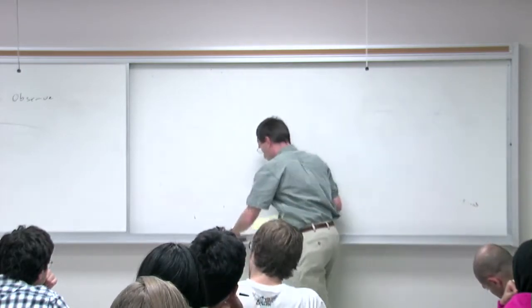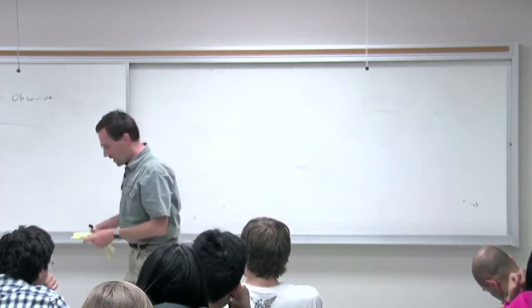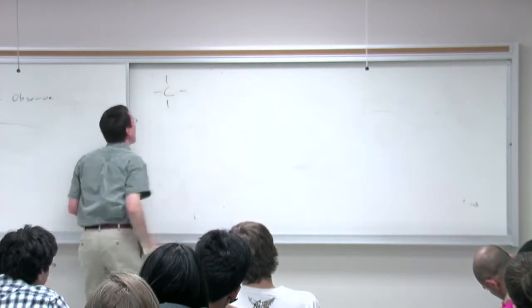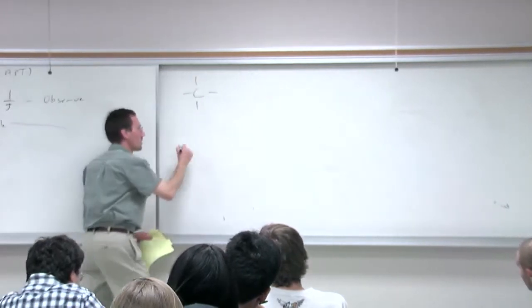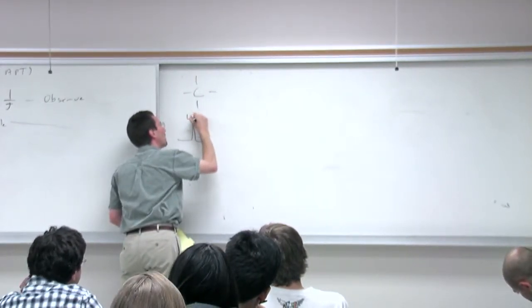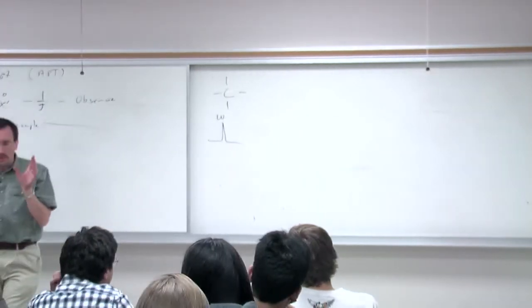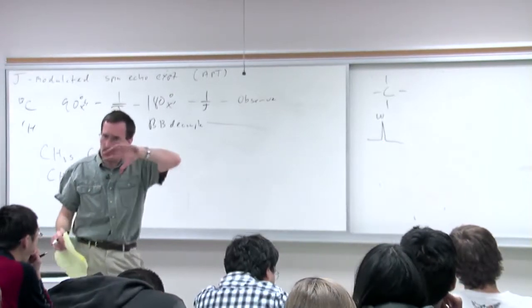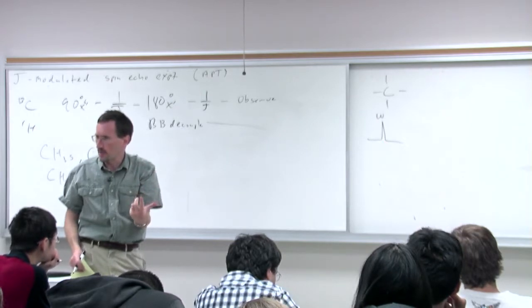All right, so let's think about what each of our carbons sees. So if you have a quat carbon, we can conceive of that quat carbon as being a peak at the line at the frequency omega. In other words, the rotating frame, as I said, is partially an artifact, partially a conceptual tool, partially an electronic tool.